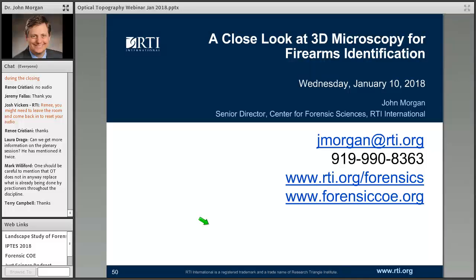And I don't think it's possible to answer those questions in a rigorous way today. I think the hope is that one day you'll be able to assess the match using an algorithm. That is, you would be able to have two images side by side, and the algorithm would give you an assessment and a number with respect to the uniqueness, although I suspect we will always need the human examiner in the loop to judge that. Because that's even true now, for example, for DNA analysis, where the underlying data is much simpler, and in particular for mixture interpretation.